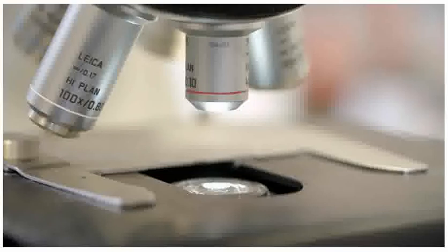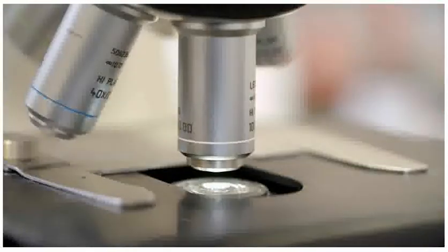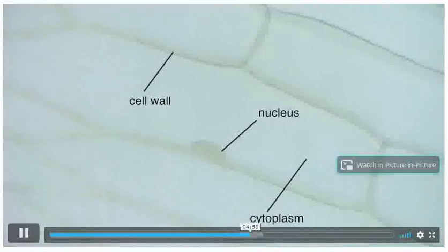To see more clearly, the magnification is increased by selecting another objective lens. The stage should be moved down before changing the lens. Can you identify the structures? It is possible to see the nucleus, cell wall and the cytoplasm.